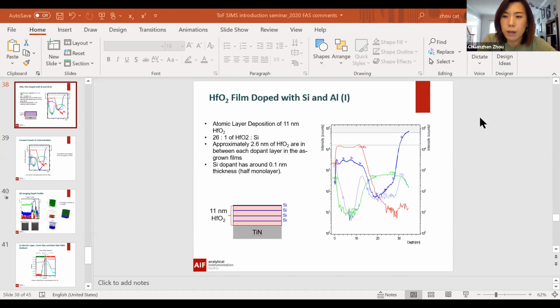Of course, the flatter the better, because the flatter sample gives you better mass resolution. If you want to identify the chemical configurations or chemical compositions, the best mass resolution gives you a more accurate peak, more precise peak assignment. Like for the fibers, you see the fabric is actually not flat, and we normally use the hydraulic press to make it flatter to give you much better mass resolution. So we do not like the raw kit type of materials.